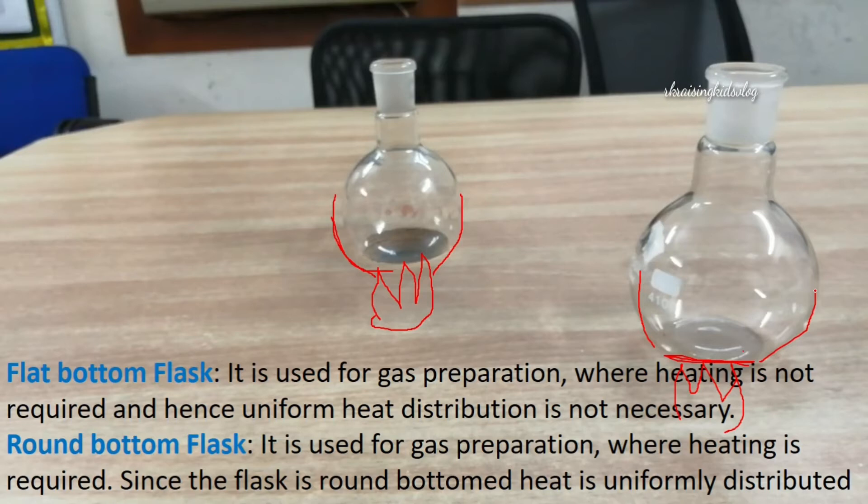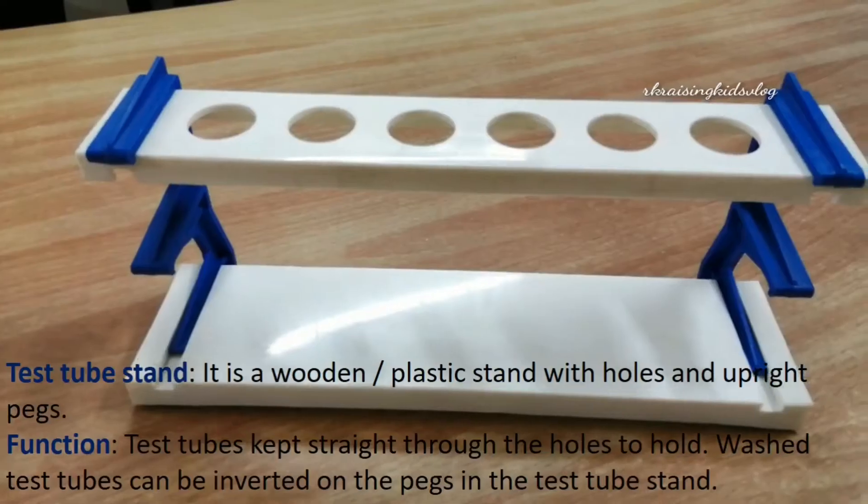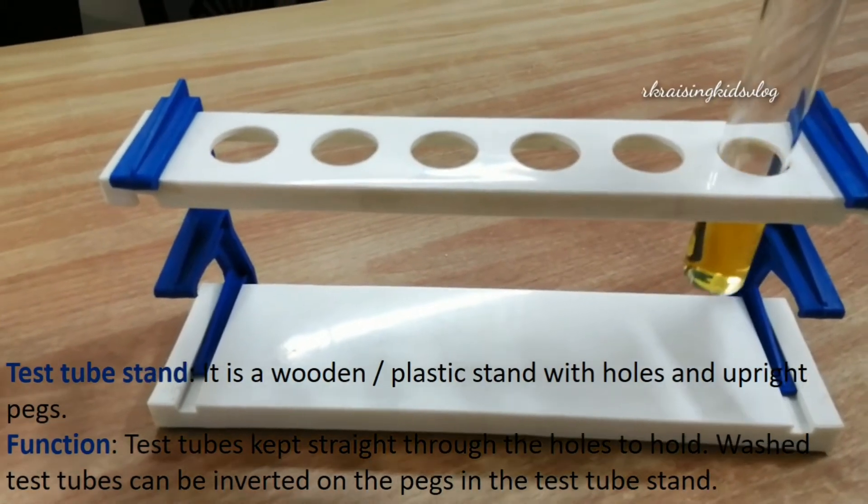So, a flat bottom flask is used for gas preparation where heating is not required, while a round bottom flask is used for gas preparation where heating is required, since the flask is round-bottomed.